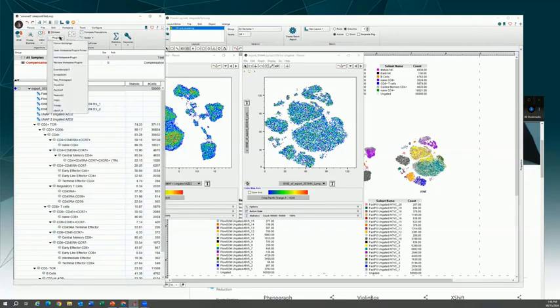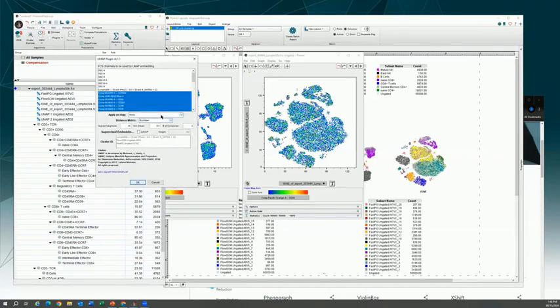UMAP. So you have some different distance metrics. Oh, I'm realizing this wasn't even on my slides. But yes, different distance metrics. When it's building the nearest neighbor graph and finds a neighbor, the metric it uses to consider something a neighbor or not is typically Euclidean distance, but there are some different methods here.